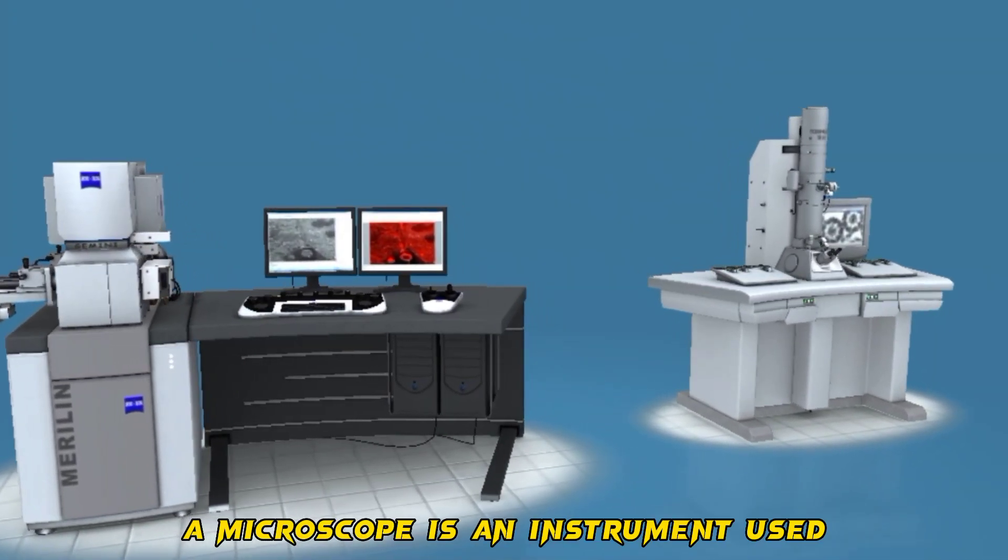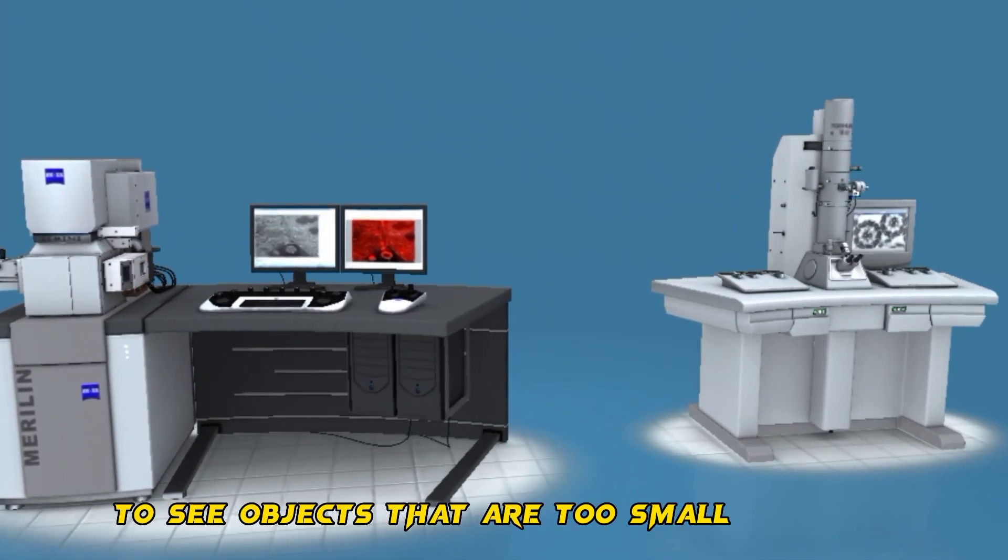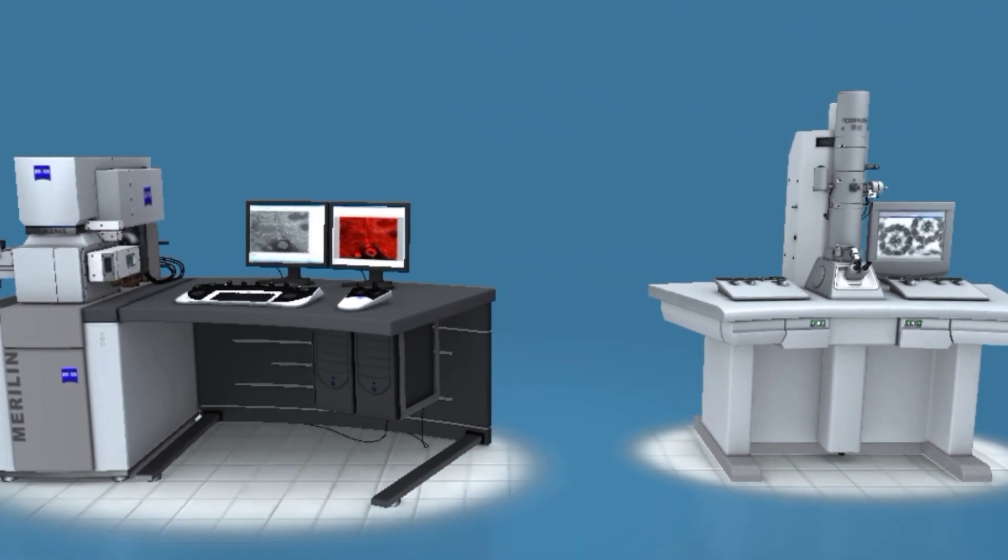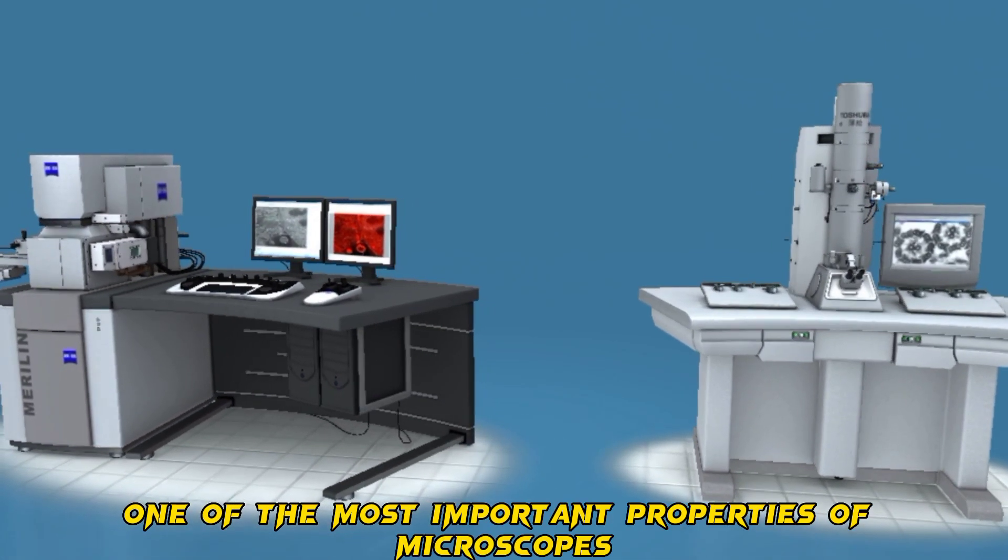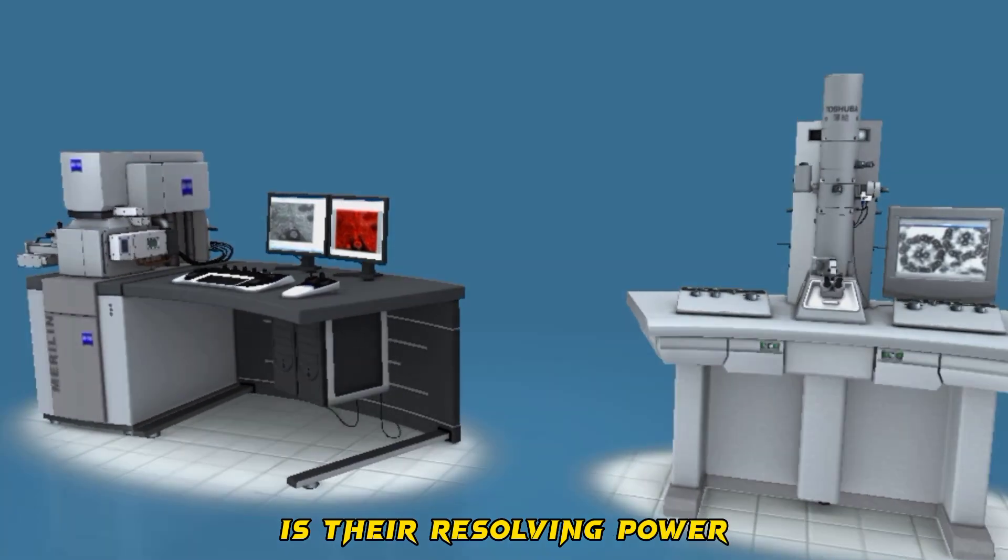A microscope is an instrument used to see objects that are too small for the naked eye. One of the most important properties of microscopes is their resolving power.